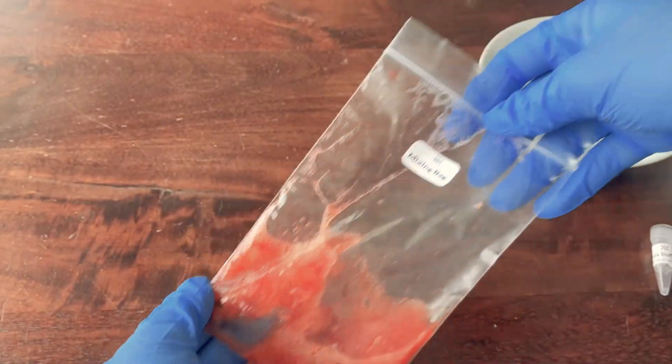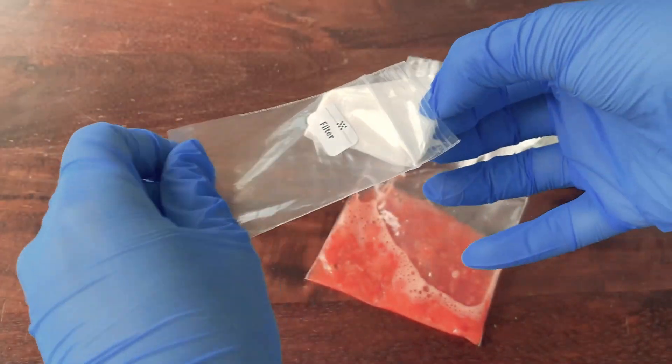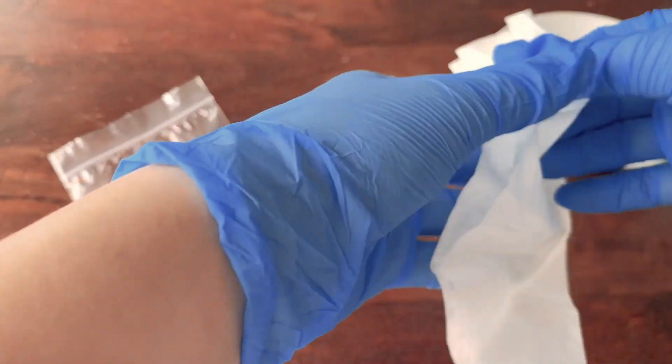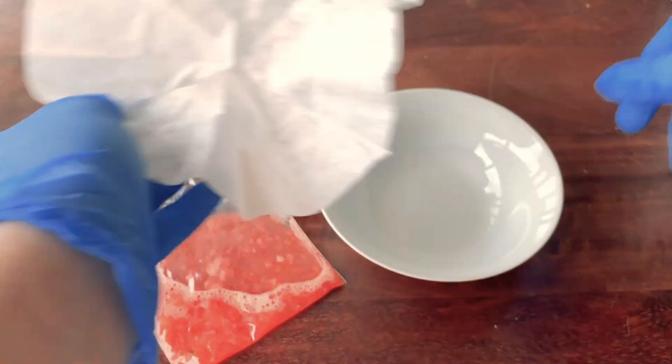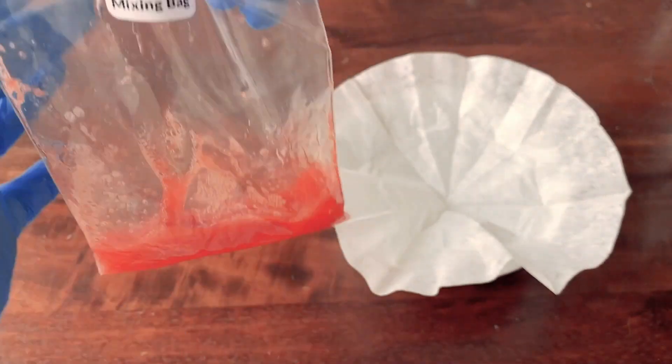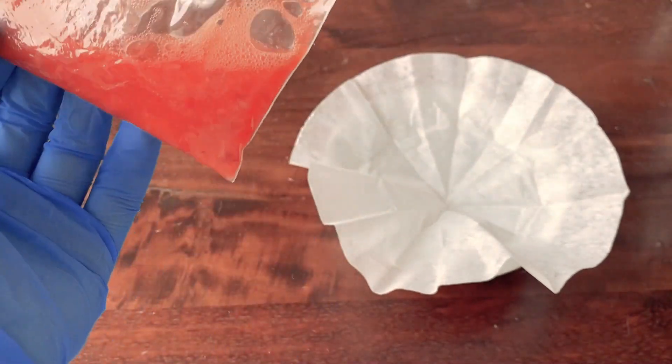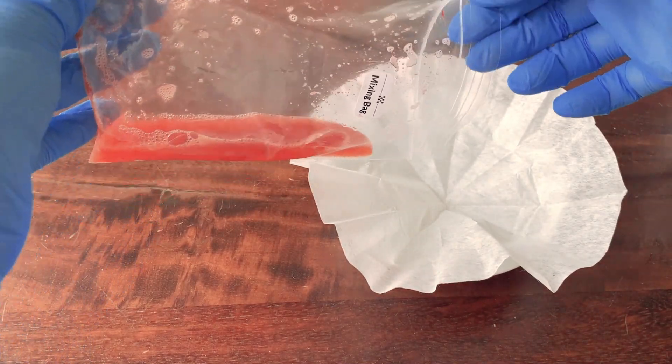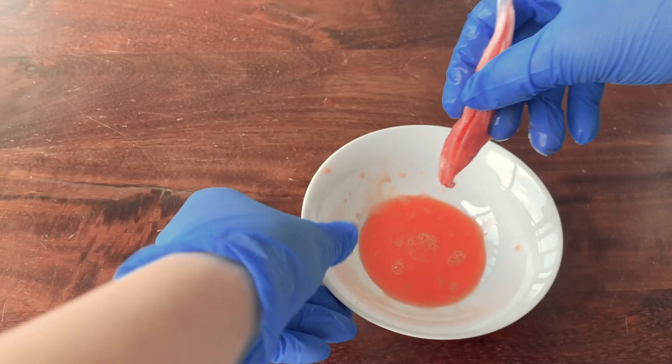So now you can see you have more liquid. The next step is filtering the solution. So now we can open the filter. You can use either a glass to put it in or a plate like this, whatever is easier for you. So carefully, one more time mix it, because you can see you still have these small cells. We don't need them. That's why we're going to filter it so we only have the solution with the DNA. This much is going to be enough.